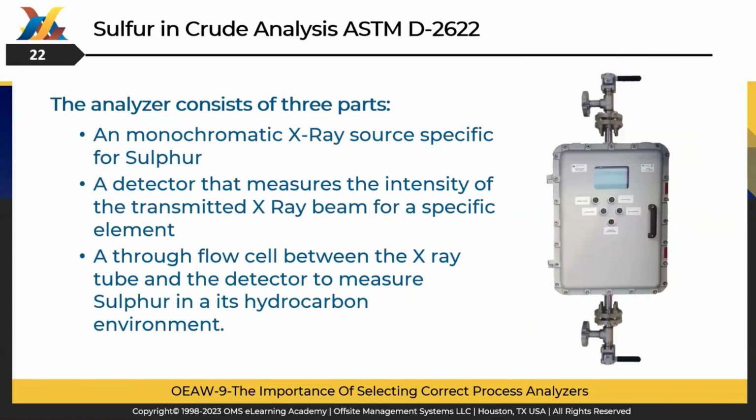Sulfur analysis that correlates to ASTM D2622 is based on the X-ray measuring method. The analyzer is very simple in operation. The flow cell goes through the analyzer and the signal from the transmitted X-ray is delivered and detected online. This method is only used for high sulfur concentration analysis on a percentage level and cannot be used for low sulfur concentration analysis, typically for the final products. For such a task, it will be required to use some other method.